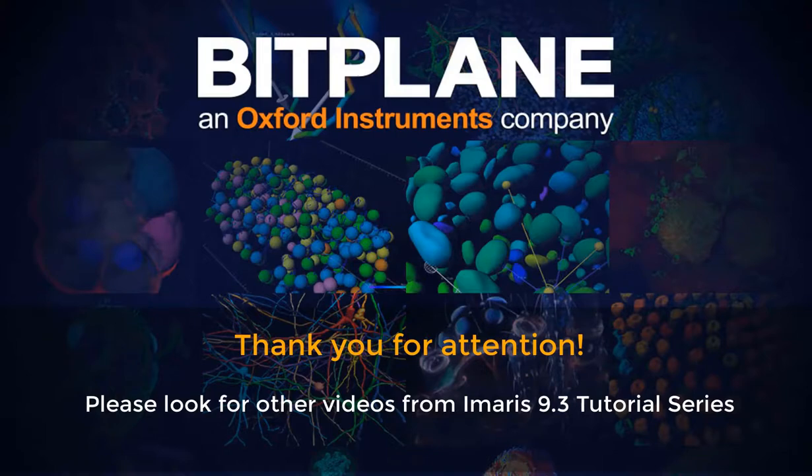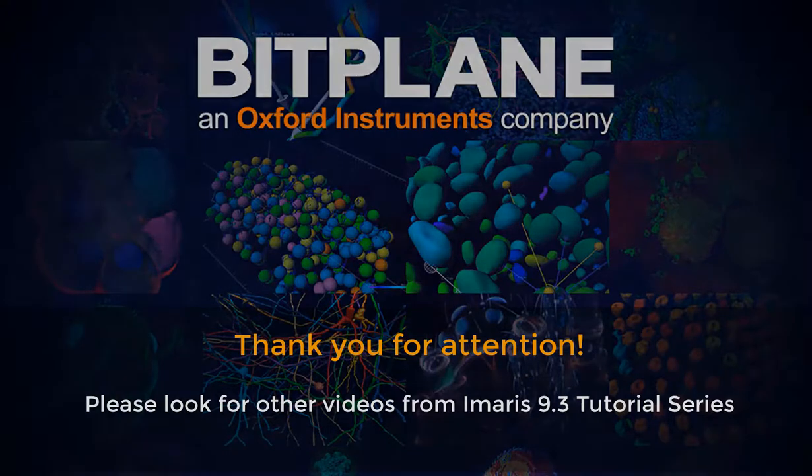Thank you for your attention. Please look for other videos from Imaris 9.3 tutorial series.